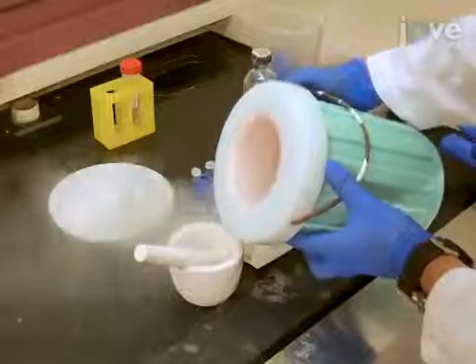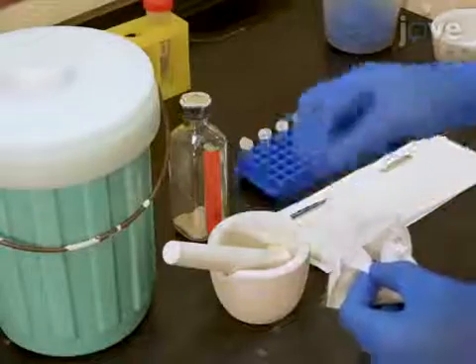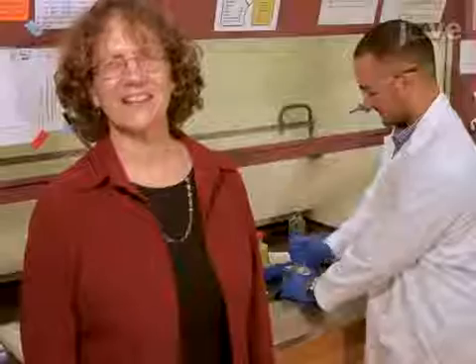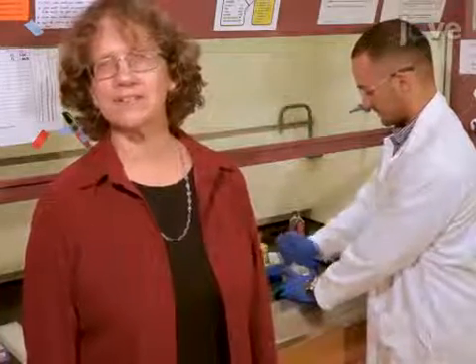Add liquid nitrogen and 30 to 50 milligrams of sterilized sand to grind 1 centimeter square of pre-selected herbarium tissue to a fine powder in a pre-chilled mortar and pestle. Adequate grinding is essential for successful DNA isolation, and care should be taken that the sample is completely pulverized.